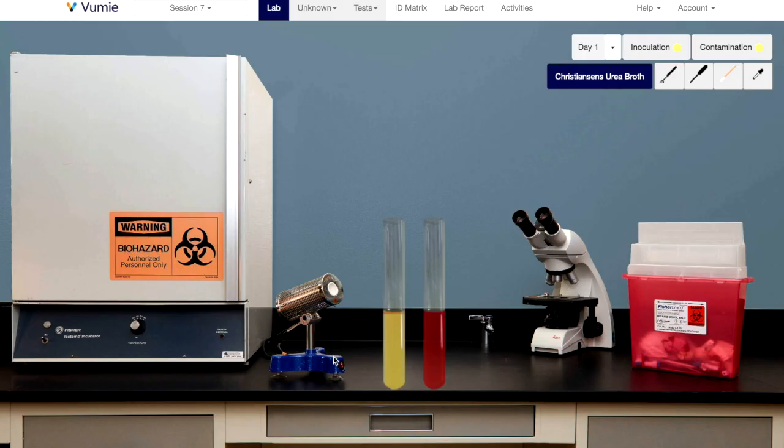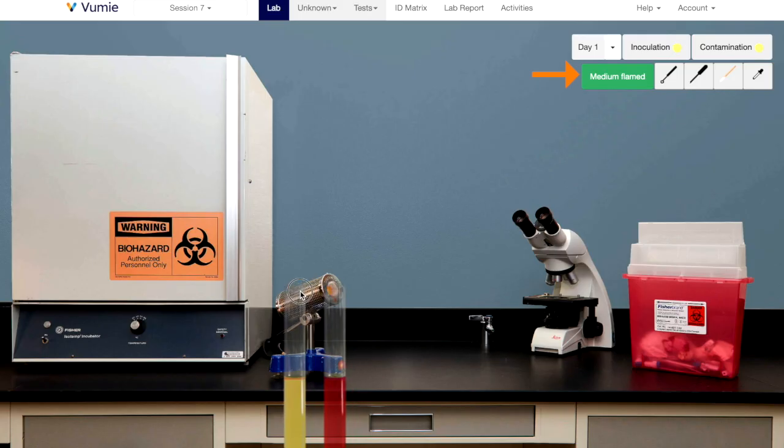Next, turn on the incinerator. Flame the mouths of the tubes. Look for the message indicating that this has been done.